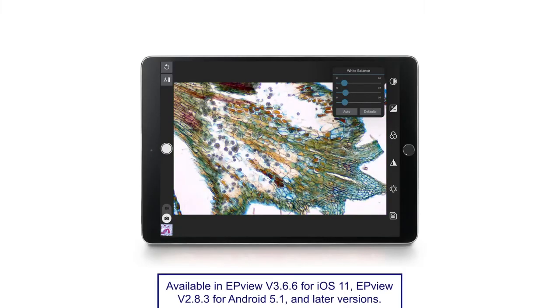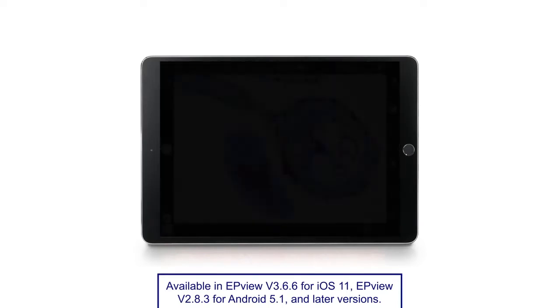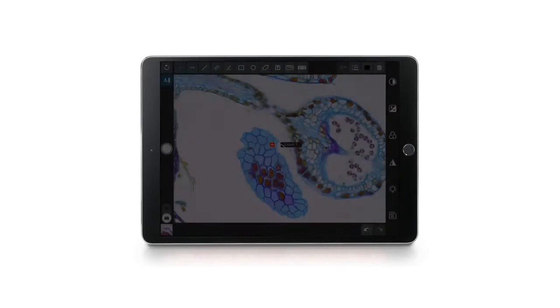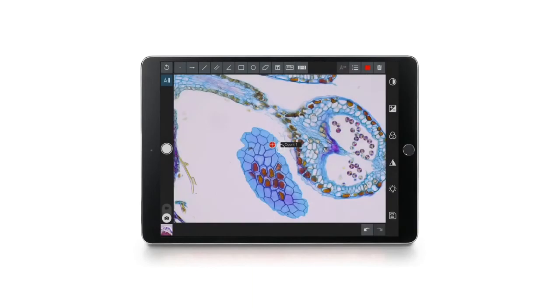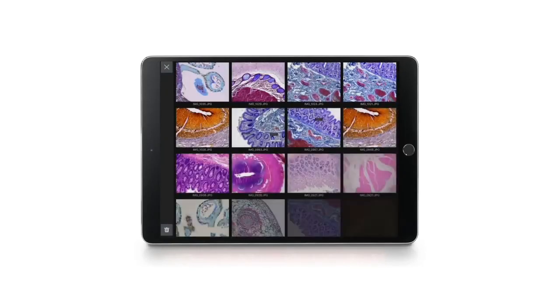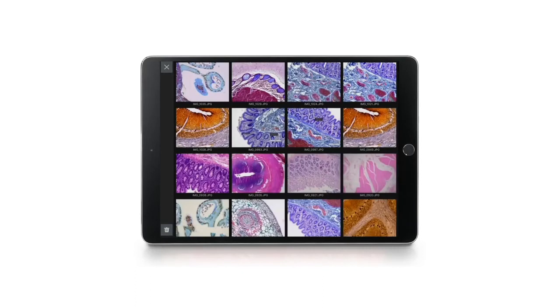Using EP View, you can process, annotate, measure, save, and share the camera's high quality 5 megapixel images. When the EP50 is allowed to access the image folders, all captured images are displayed in a gallery.